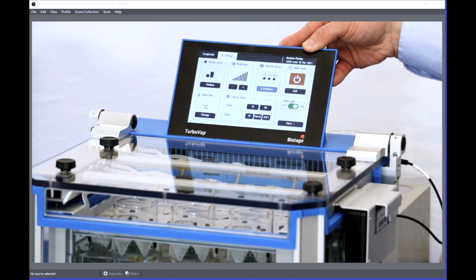And then if you leave the lab and you forget to turn the system off, you don't have to worry, because you could set the sleep timer for 5 p.m. and it'll shut off automatically, so there are no baths left on in the lab.